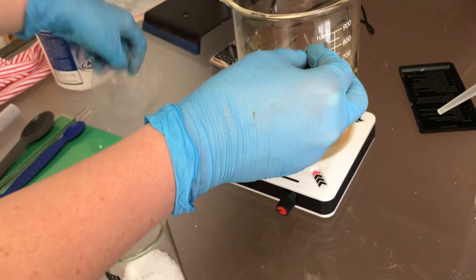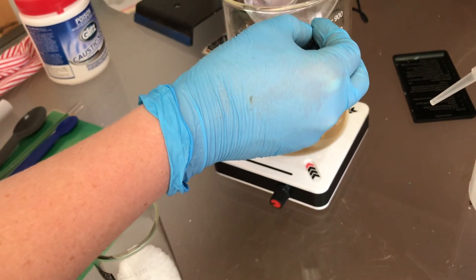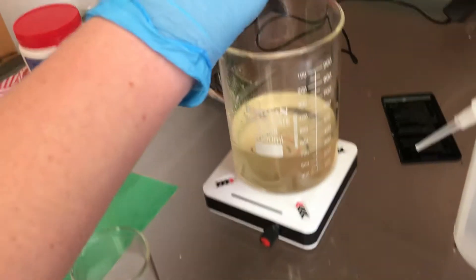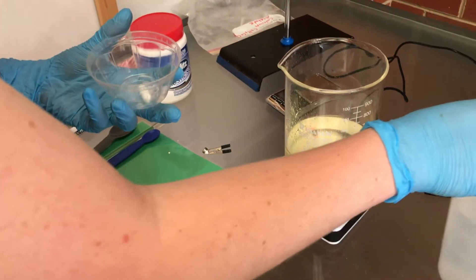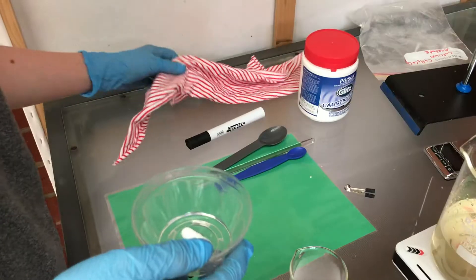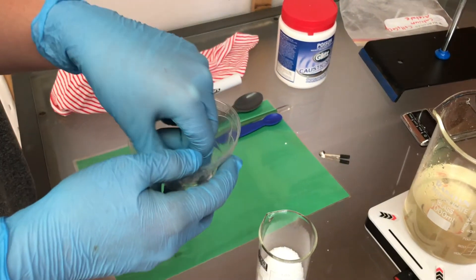Here I am using a magnet to get out the stir bar. I then put the stir bar into a little plastic container and rinse down with water. I then use an old t-shirt to dry the stir bar.